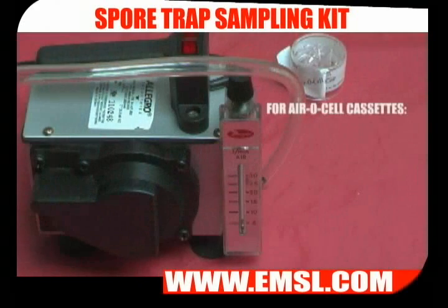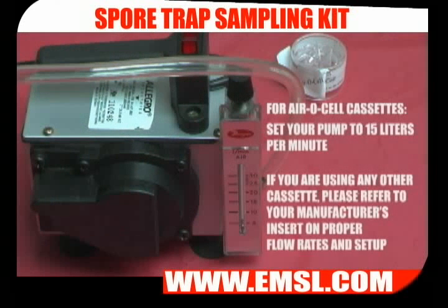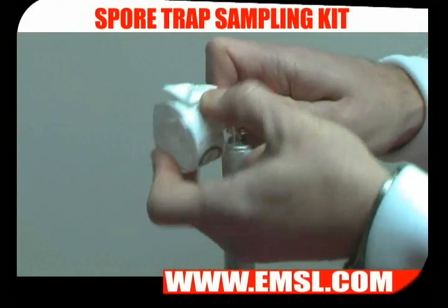Using the aerosol cassette, set your pump at 15 liters per minute. If you're using a different type of cassette, check with the manufacturer's product insert for the correct flow rate. Attach your cassette to the round end with the poly tubing.